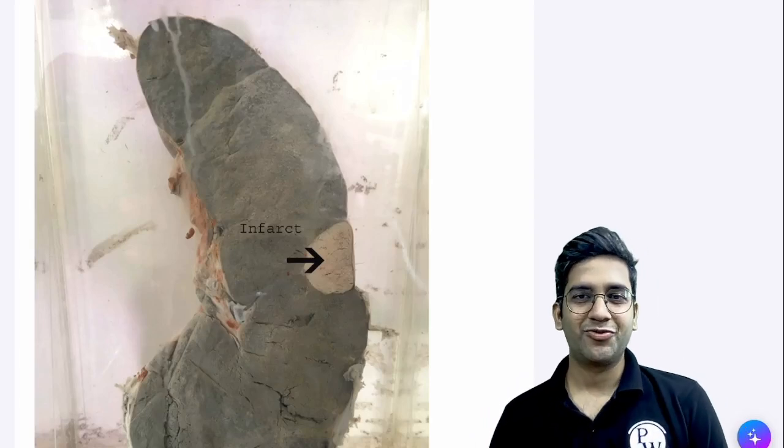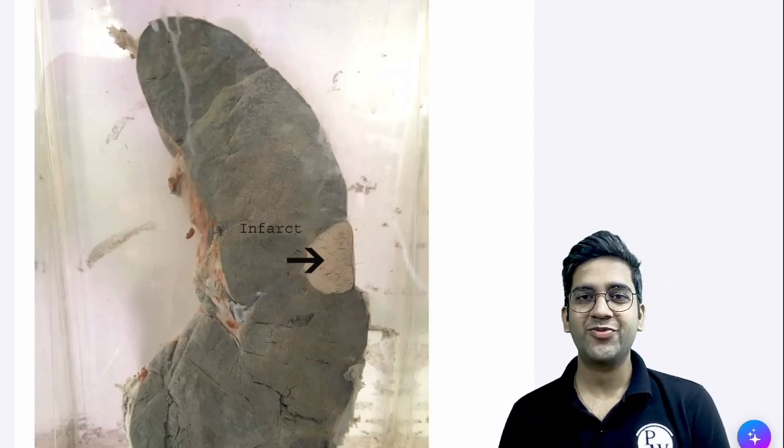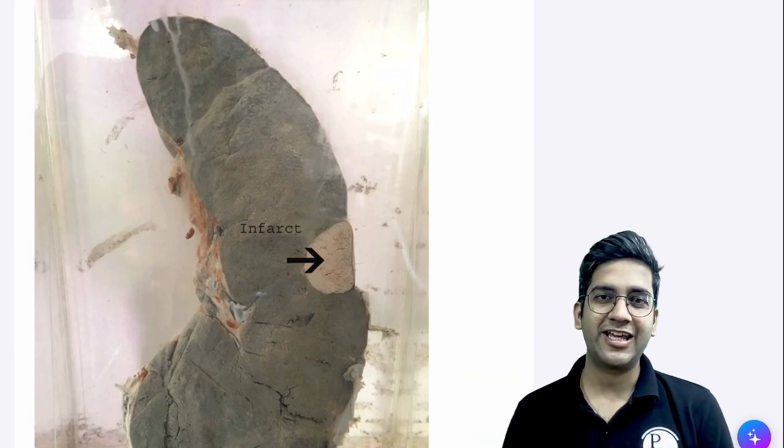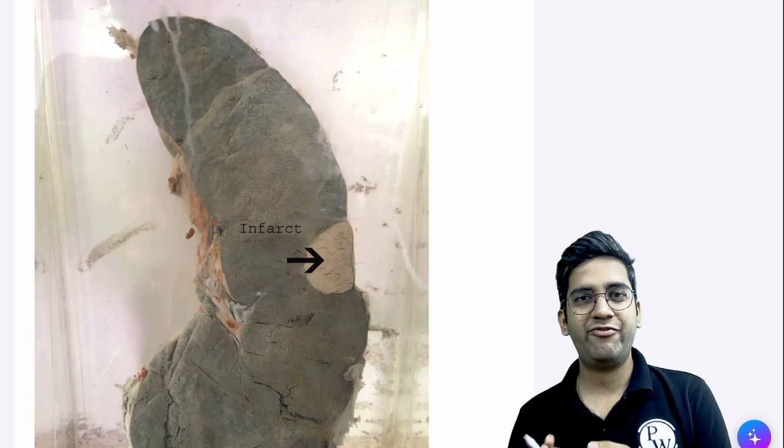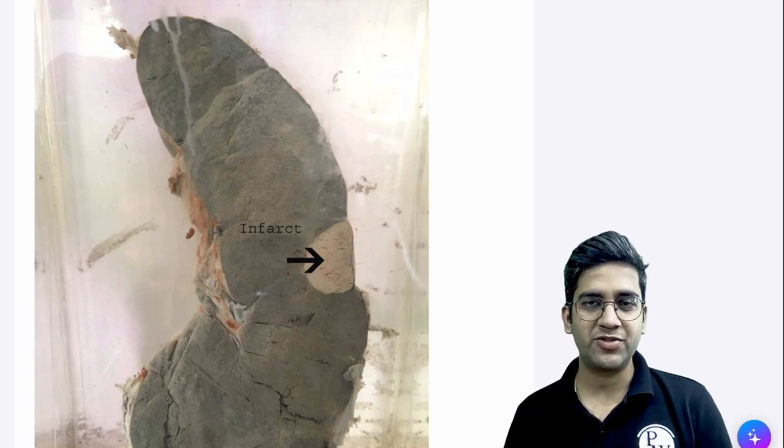Hello guys, welcome back to one more session of gross pathology supporters. In this session we are going to see a classical specimen of splenic infarct. As you can see, it's a perfect well jar-mounted specimen of splenic infarct.